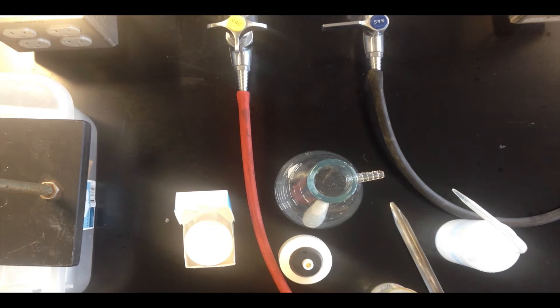In this video, we're going to talk about vacuum filtration, which is an extremely valuable technique for separating heterogeneous mixtures of solids and liquids, such as you might get after a precipitation reaction or a crystallization process.